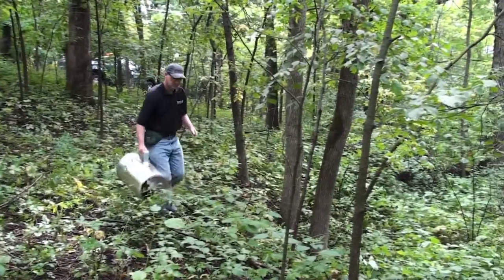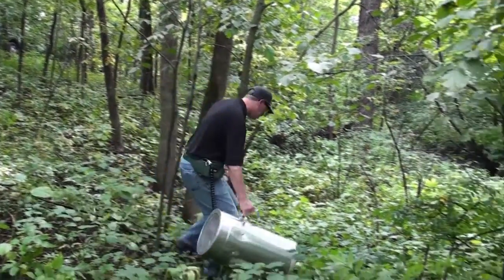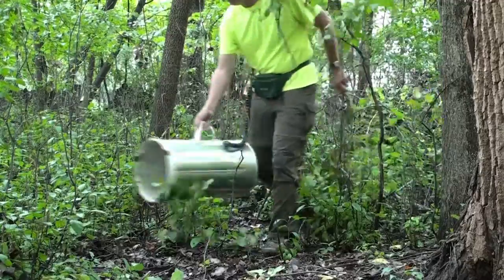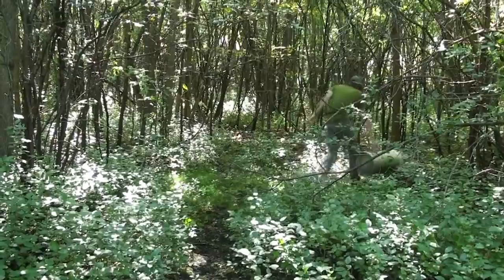At MMCD, we use a large mechanical aspirator for surveillance of certain disease-transmitting mosquitoes that can be difficult to collect using other surveillance methods. The aspirator we use was designed and built in-house by MMCD employees.